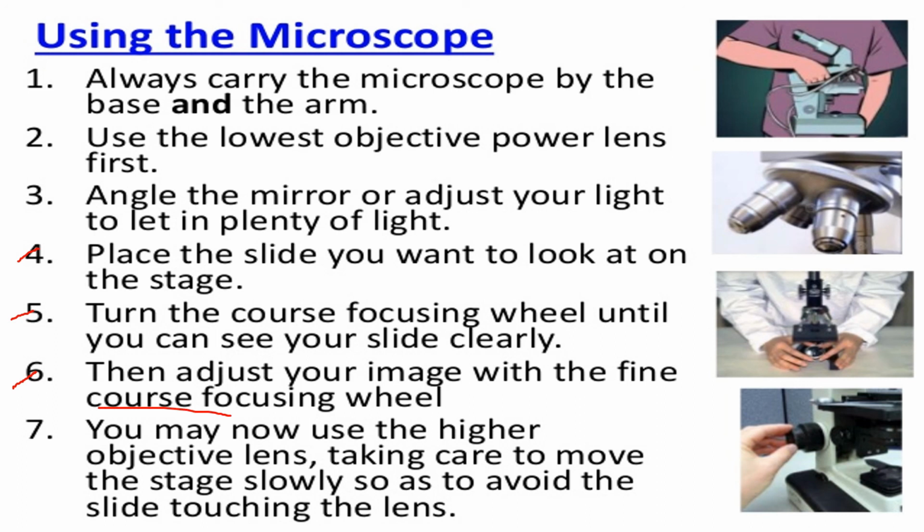And lastly, you may now use the higher objective lens, but take care to move the stage slowly so as to avoid the slide touching the lens na pwedeng mag-cause ng pagkabasag ng glass slide.